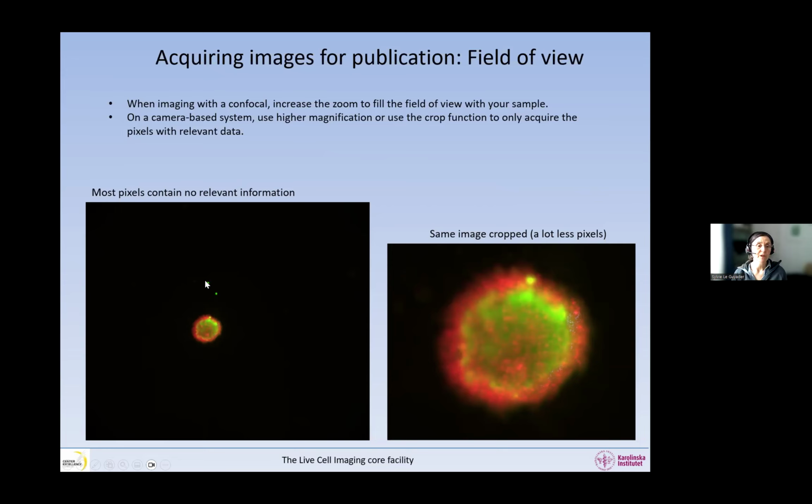In this image, we have these two little things that are there and that are, you know, whatever this is, background, right? Something that is really fluorescent and we don't want. So you need to interpret what that is. But if this is irrelevant for the interpretation of this image, then it's totally okay to remove it, to crop it, basically, so that you only show this.